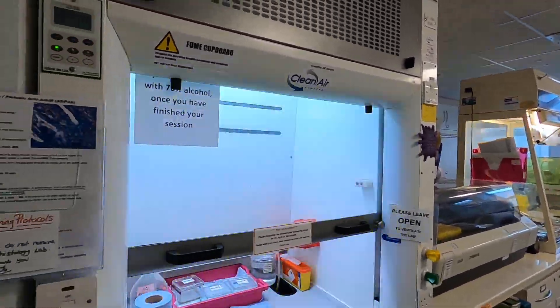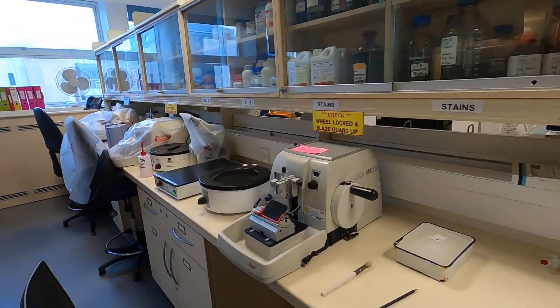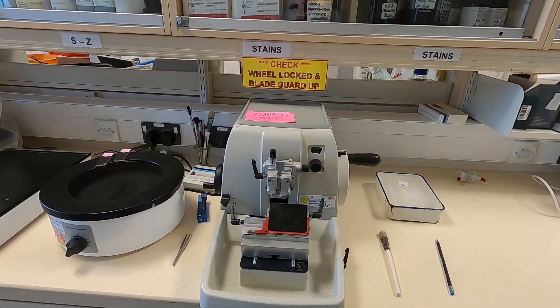So you will have a number of fume hoods that will be present. You will have a number of bits of equipment like this one here. Now this is a microtome, and we'll do a lot more with that in a separate section in a minute.